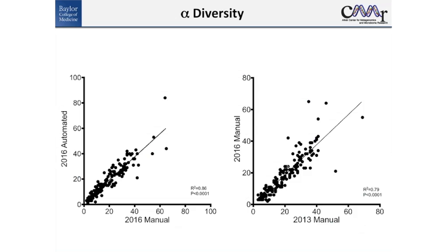Okay. And then how much PhiX did you use for your samples, usually on your MiSeq run? Yeah, that's a great question. We typically run about 4%, which is much lower than what Illumina recommends. In fact, when we have any issues and we call tech support, they question us as to why we're not. But it eats up a fair amount of sequencing real estate, and so we keep that to a minimum. Now, with low biomass samples, we will increase that to up to around 15%.